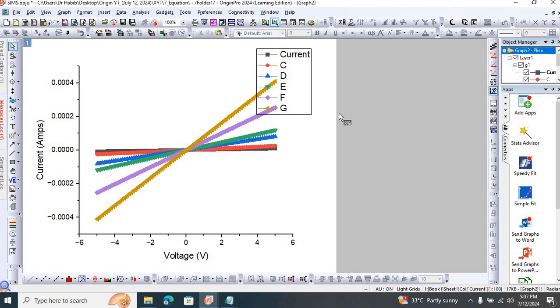And then at this point I can play around with the scales and the traces in order to perform the settings, starting with the X and Y axis.